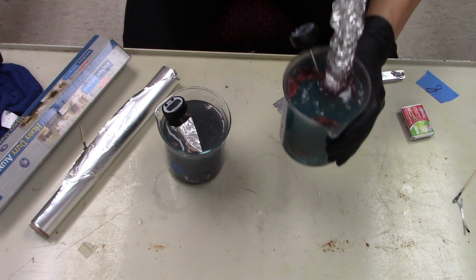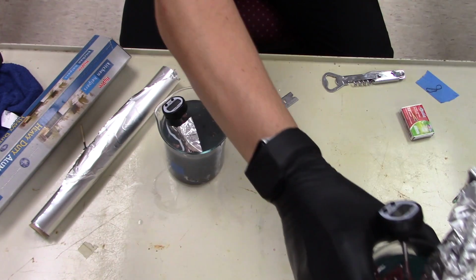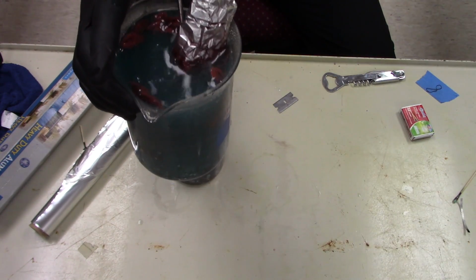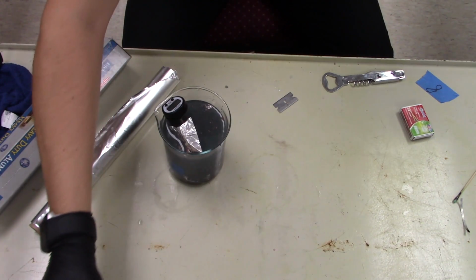Anybody want to feel it? It's not dangerous. I'm gonna hold it though. Feels like a cup of coffee. Anybody else? Okay. Okay, so go ahead.